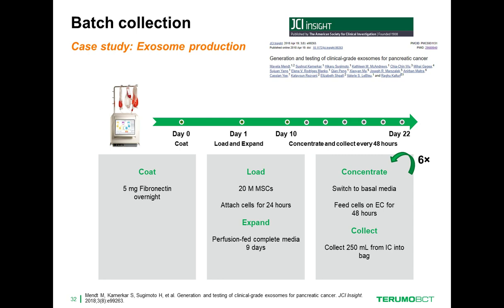Dr. Rahul Kaluri's group in MD Anderson reported the successful exosome production with the Quantum using batch collection scheme every 2 days for a period of 12 days. In that protocol, the Quantum was used to expand MSC, mesenchymal stem cells, for 9 days with serum supplemented media until confluence was reached. The media was automatically replaced with serum-free media for exosome production.